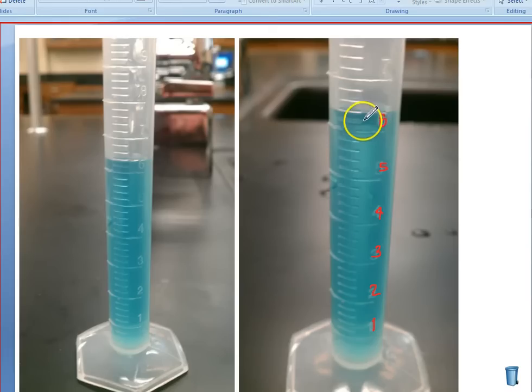I can see that I don't have 9 lines between 6 and 7. So that means that each line here is not 0.1 milliliters. I have to figure out what each line does represent. Since I have 4 lines, it's probably 0.2 milliliters. Let's count and see. Here's 6.